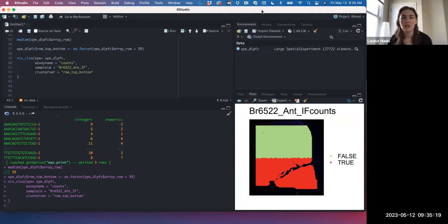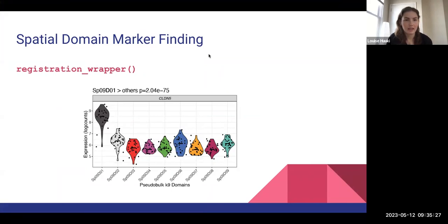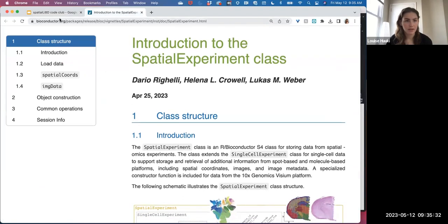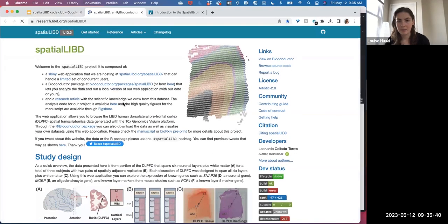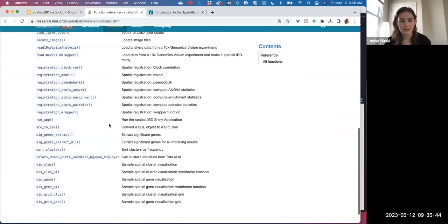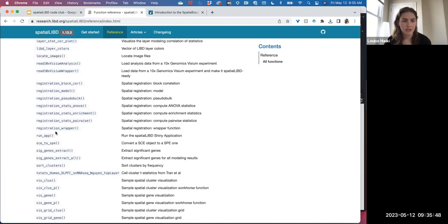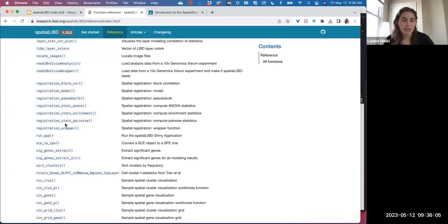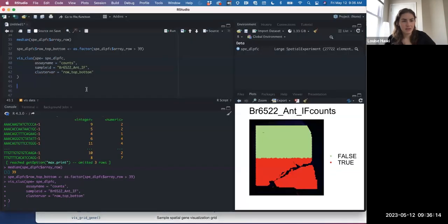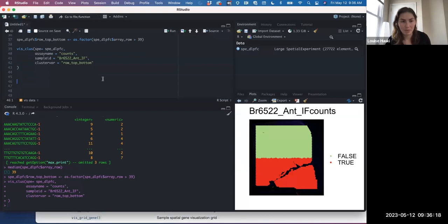Let me show the steps of the process. The first step is pseudobulking. For each of our classes — top and bottom — we sum all the counts for each gene. So instead of having maybe 2,000 columns for a sample, now we have two. This makes the data much more condensed, helps remove sparsity, which is important for marker finding. We'll use registration_pseudobulk, giving it our SCE object, the var_registration as row_top_bottom (our new cluster variable), sample_id, and covariates like age and sex that are important for the differential expression model.